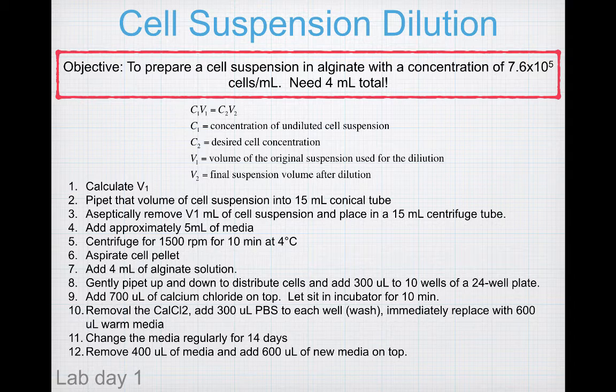Then you'll take off that PBS. This is called a PBS wash. And you'll replace with 600 microliters of warm media. Then keep the well plate in the incubator for 14 days.